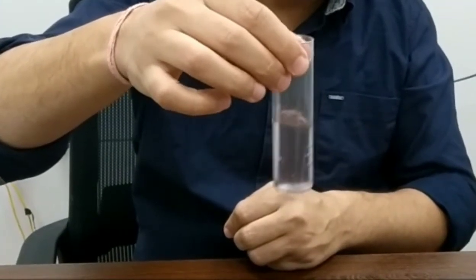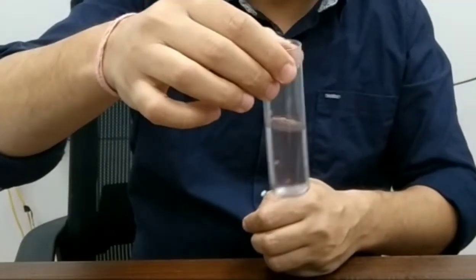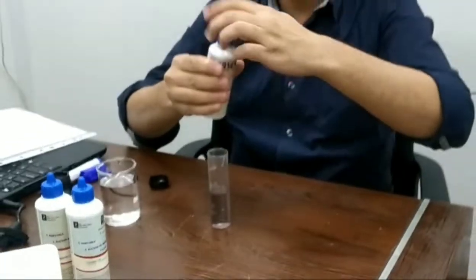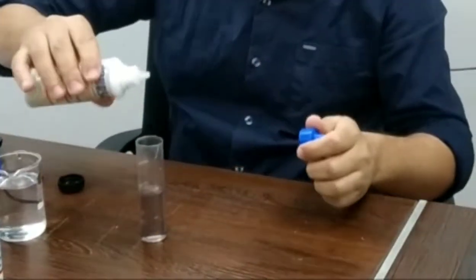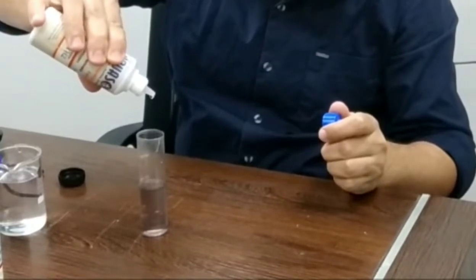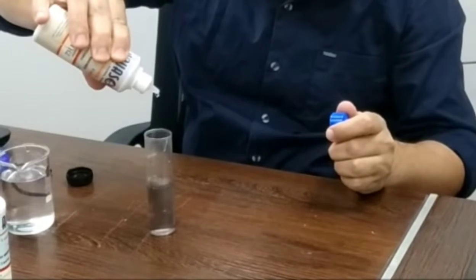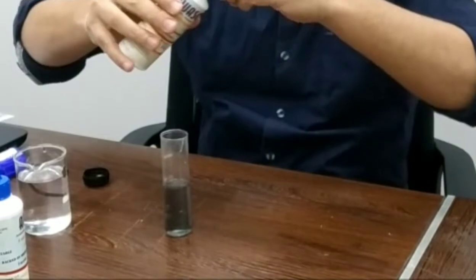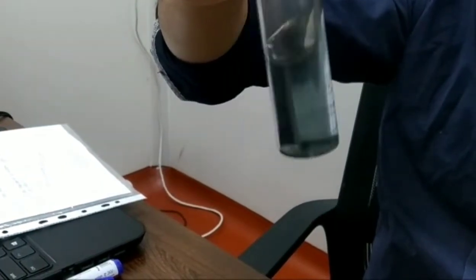Now we are going to add the second reagent, TH2. TH2 is in liquid form and we have to add it drop-wise. It is recommended to add 10 to 12 drops of this reagent in the sample. After addition of 10 to 12 drops, the color changes from clear to blue. This means there is no hardness in the water. If the color changes to pink, that means there is hardness in the water.